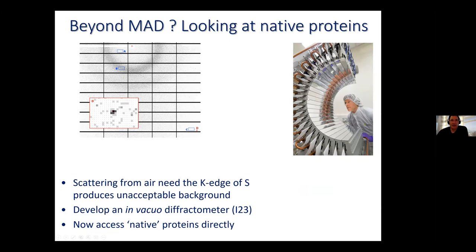So it required the development of a very large area detector, which could withstand a vacuum. And then this detector, together with the way of mounting the samples and bringing in the x-rays, was put inside a box about 2 by 2 by 2 meters. And the first measurements were amazing. I know it just looks like a fuzzy gray pattern, but the point is each of these dots is a diffraction spot that is part of the diffraction pattern from this material.